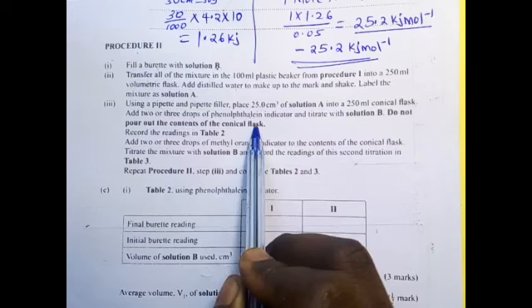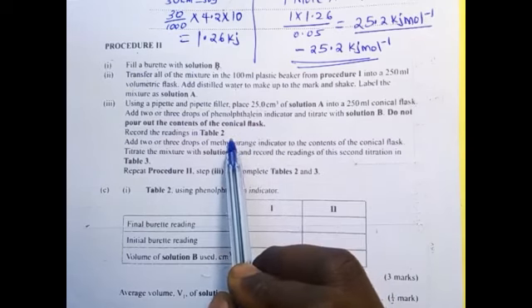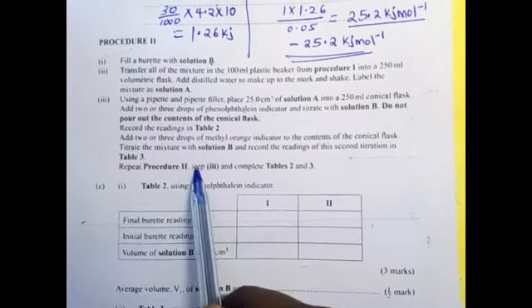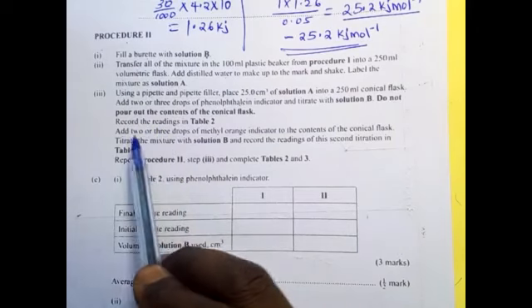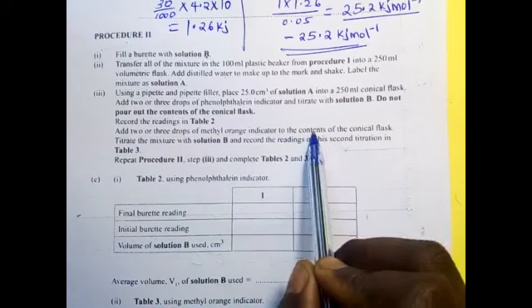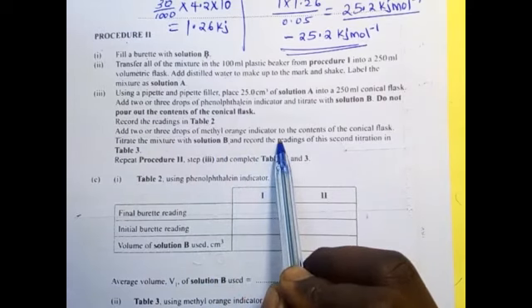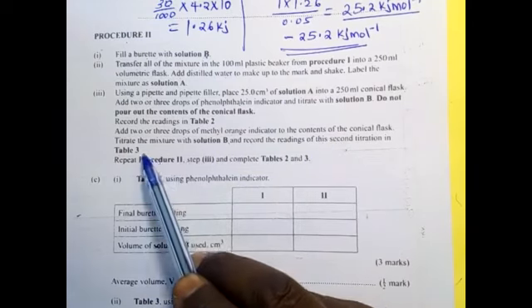Don't pour. So you need to follow instructions. That's why you are supposed to use 15 minutes first to read through the instructions before you start doing the practical. Then record the table, and then add 2 or 3 drops of methyl orange indicator to the content of the conical flask. Titrate the mixture with solution B and record the reading in this second titration, table 3.